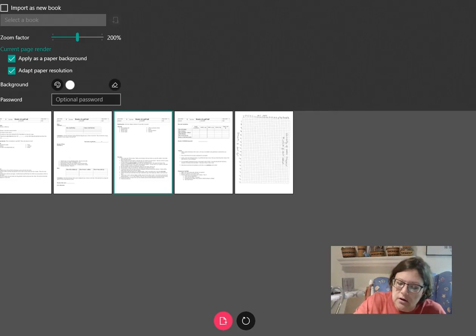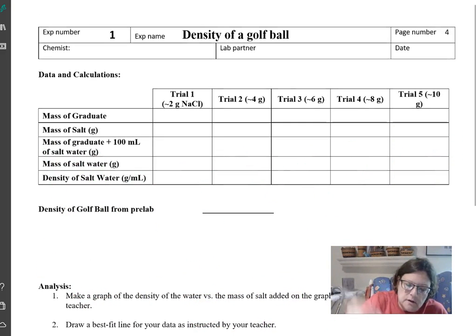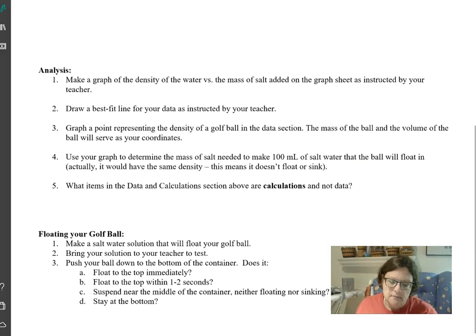So we can look here, and it's going to have all our drawings on it. This will be the empty graduate. Here's the mass of the salt. Here's the 2 added together. Mass of the salt water and the density of the salt water, so on and so forth. Now, these 6 or 5 values aren't going to be exactly the same, and that's okay. All right? Just be careful. If you spill, if you think you've made a mistake, fix it. It's not a big deal. All right. Thank you very much.